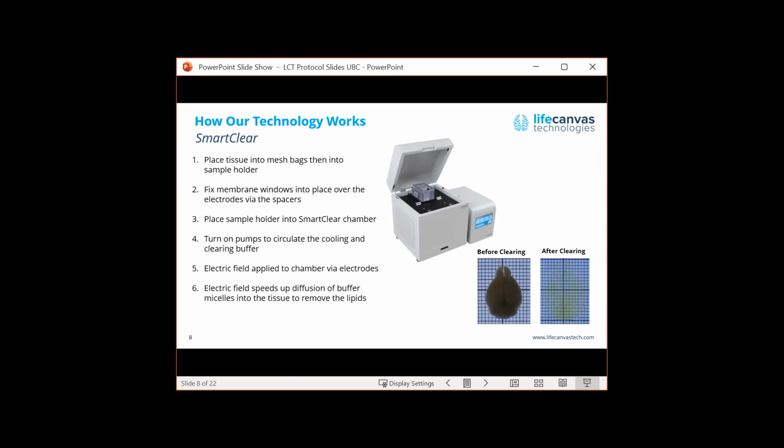There are two clearing buffers, one that flows on one side of a set of nanoporous membranes and one that flows through the sample. The reason for the separation is largely to preserve the buffer life by preventing too much detergent from being electrically oxidized, as well as protecting the sample from any electrolysis products that come from the electrodes.